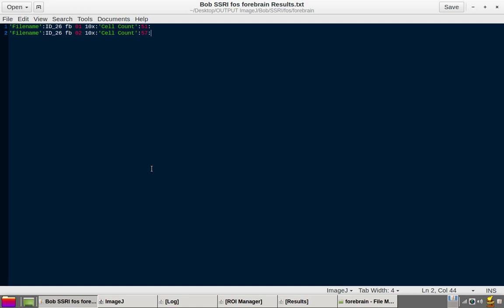And at this point, one can continue with the entire sample of the experiment. And that's the assisted point count with Find Maxima tutorial. Thank you.